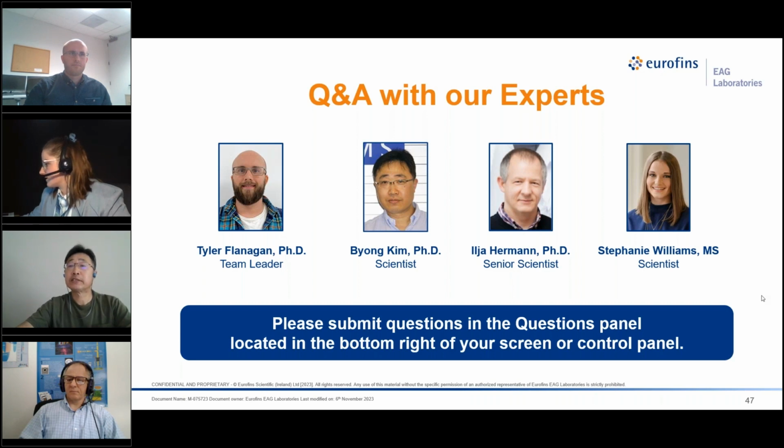Okay, and can we quantify residual stress with nanoindentation, or is it more of a comparable experiment? So yes, there was one slide where I addressed this a little bit. There is no direct or easy way, but it was of course demonstrated that it is possible. The idea is that nanoindentation itself introduces residual stress.